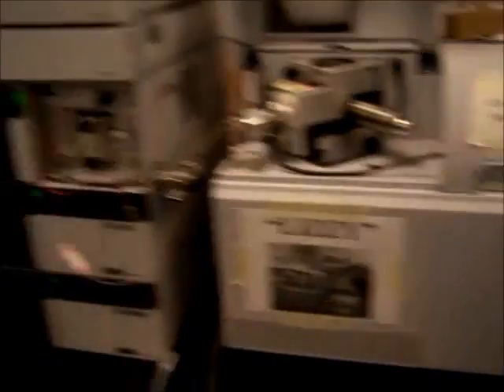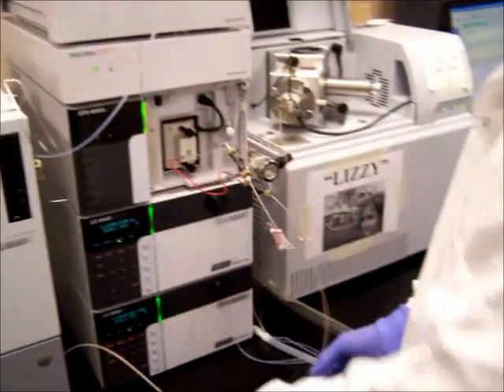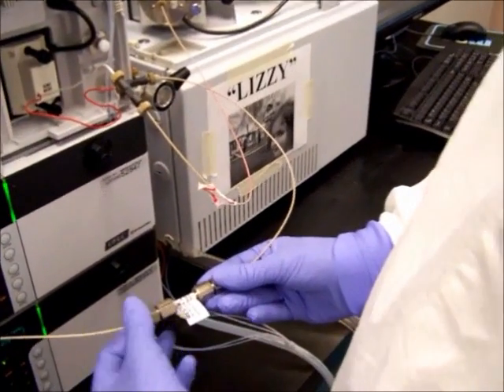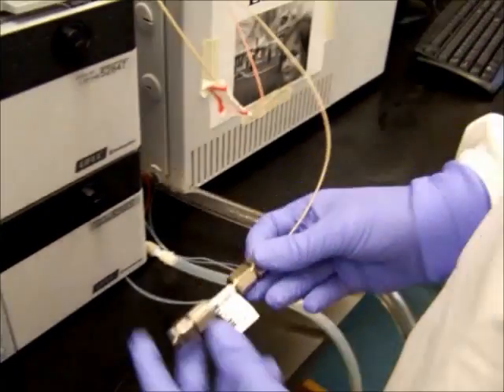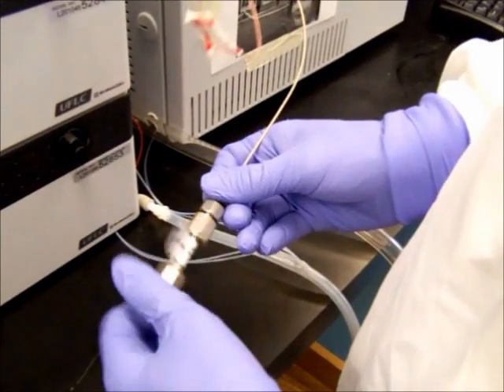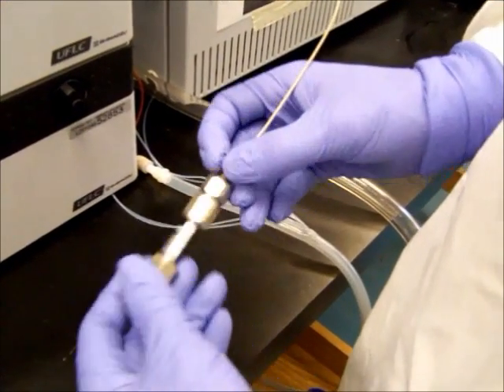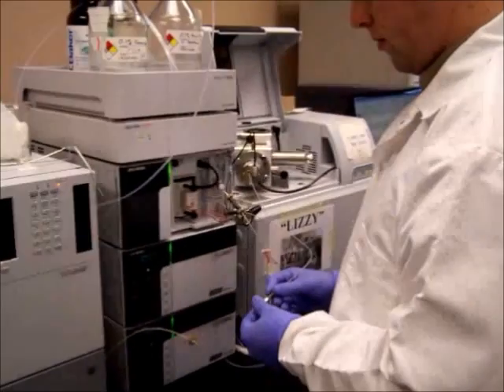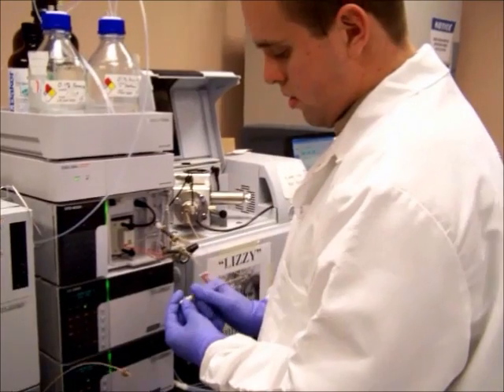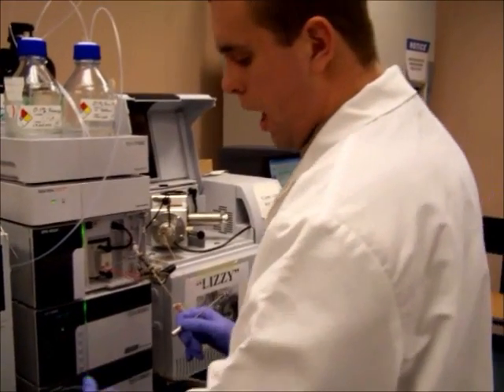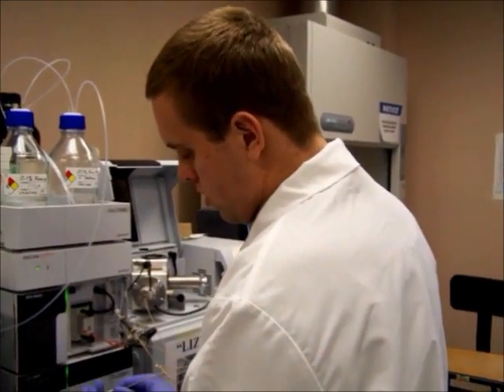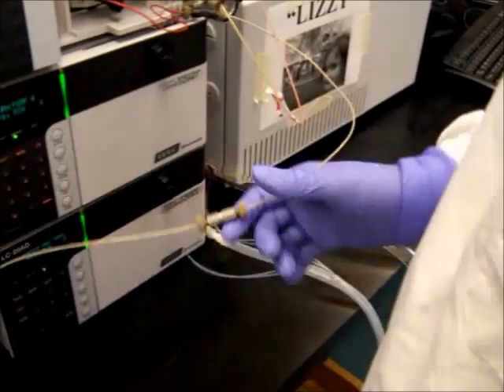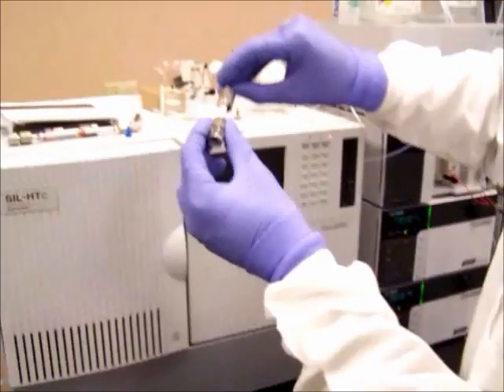Go to the machine. Pumps are off. Remove the column. Put the connector on connecting the two lines.